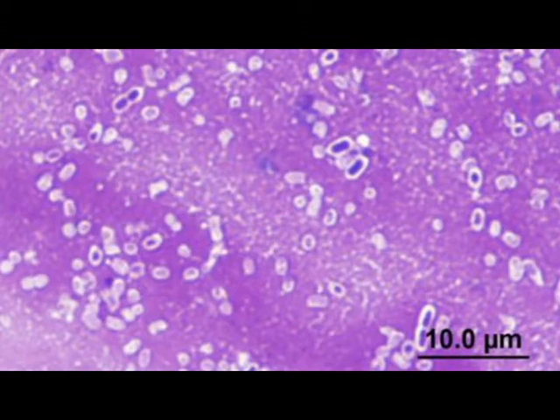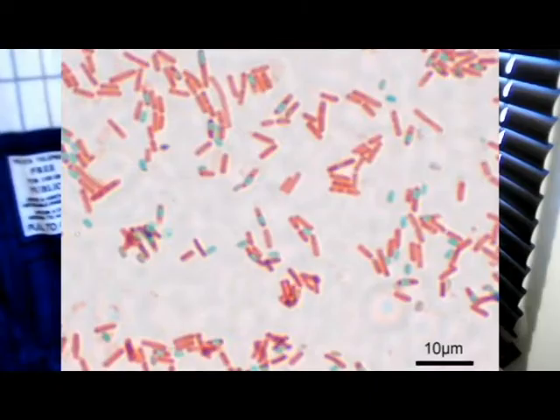Or maybe it'll be a picture of a spore stain with an arrow towards the blue spores and an arrow towards the orange bacteria. This is the picture you have in your lab book. That's why I'm using those colors. And you'll be asked, like, what is A, what is B?